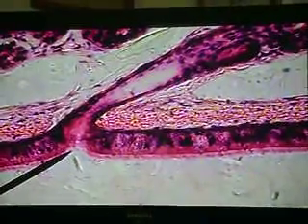So there are the goblet cells right here, a number of them, and there is the gland. So these are a number of tracheal glands right here, and there is a duct. That's the duct of the gland right here. So the secretion of this gland is poured right onto the surface membrane. That's very interesting. You can actually see where one of the tracheal glands is entering right into the lumen of the trachea. And note the what? The cilia. So it's a beautiful slide of the trachea. Really a top-notch slide of the trachea.